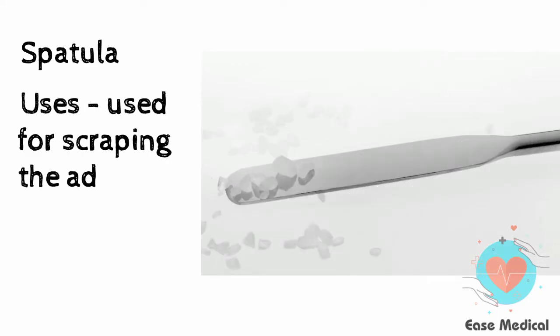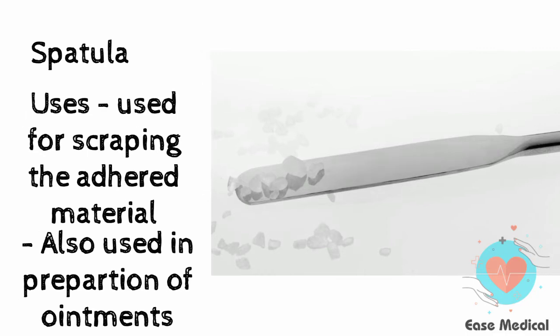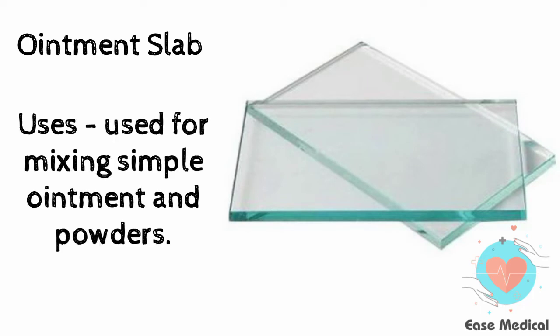Now, spatula, used for scraping the adhered material, also used in preparation of ointments. Next, ointment slab, used for mixing simple ointment and powders.